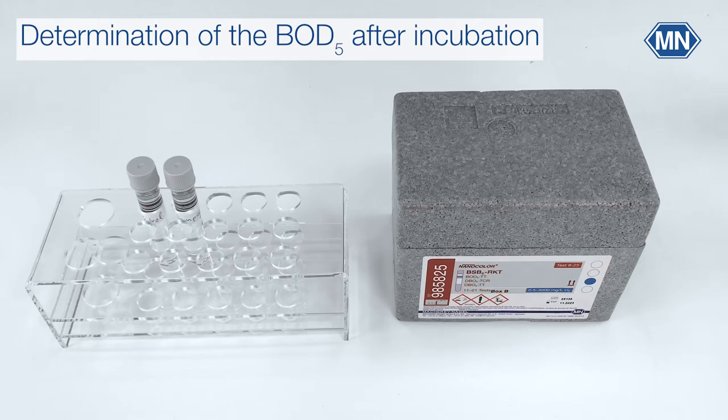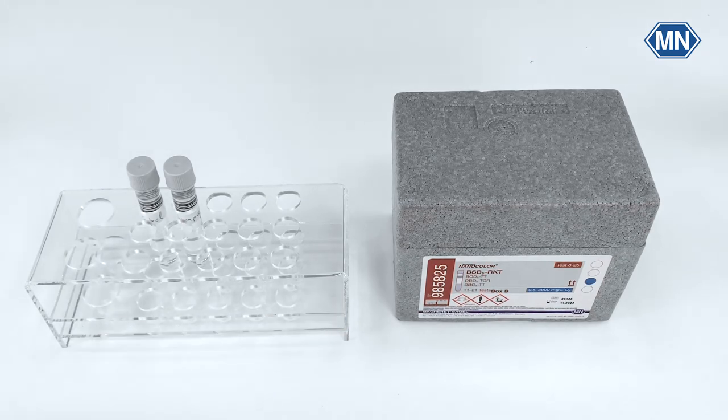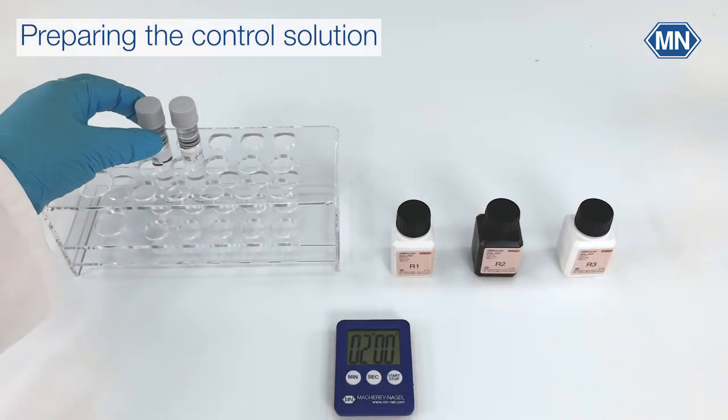After five days of incubation at 20 degrees in the dark the concentration of dissolved oxygen must be determined. For this you need all incubated test tubes as well as the reagents from box B. First take the control solution tube.